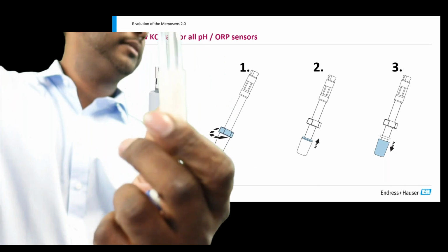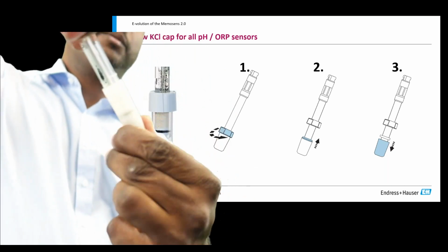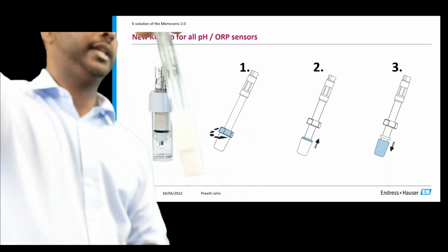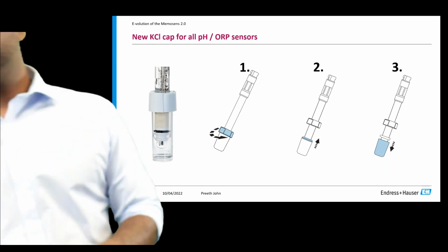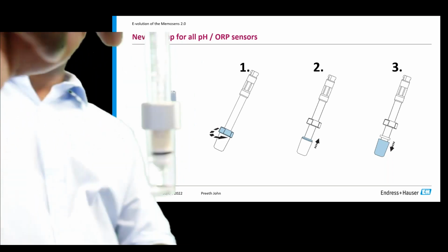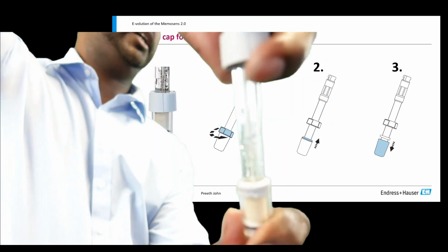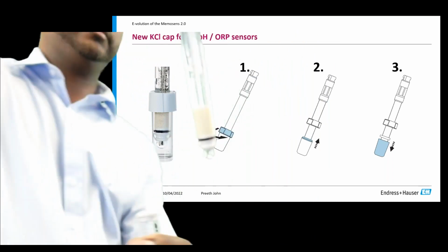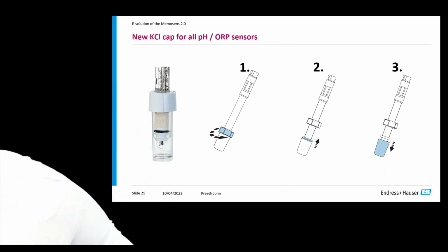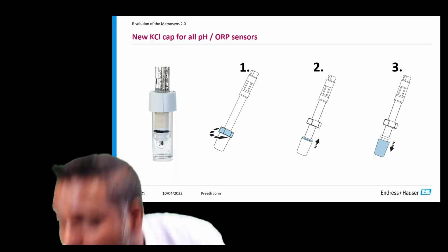silicon cap, okay? And the KCl is squeezed in and it's sort of compressed fit. So it does the job, but it can be a little bit annoying. So the new cap, as you can see here, has got a bayonet fitting, and as such, easy to use and easy to detach. Quite easy and quite friendly. The cap gives us.